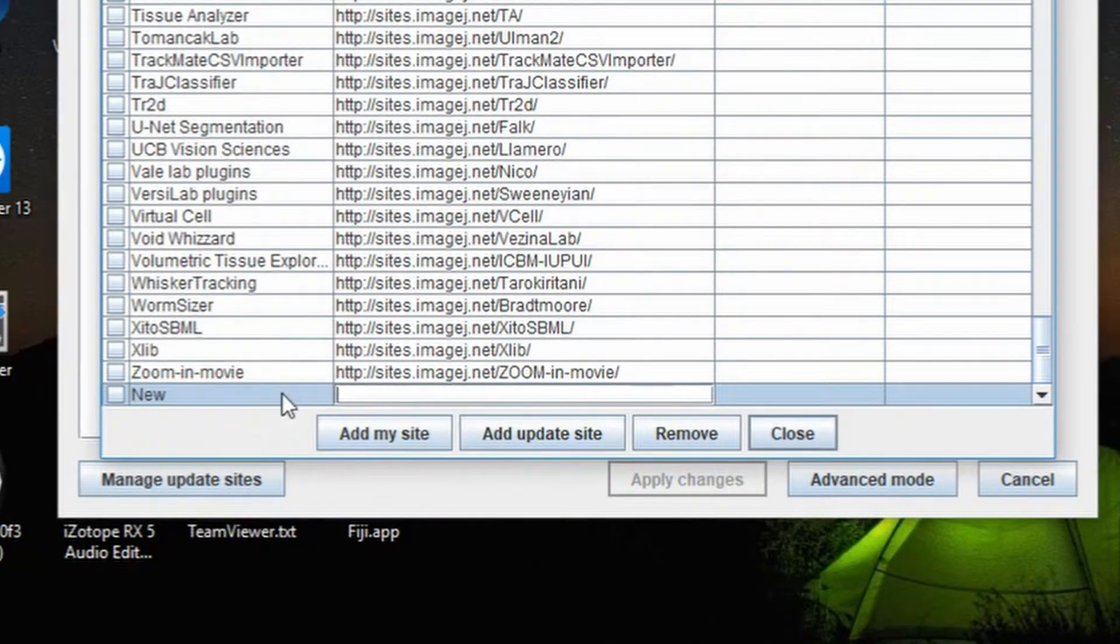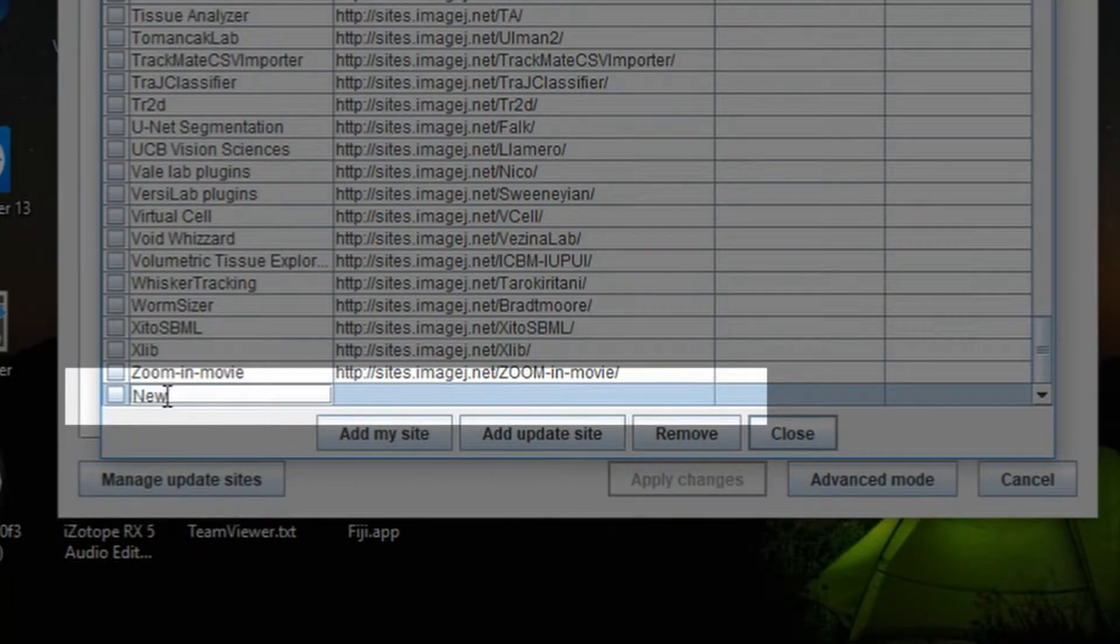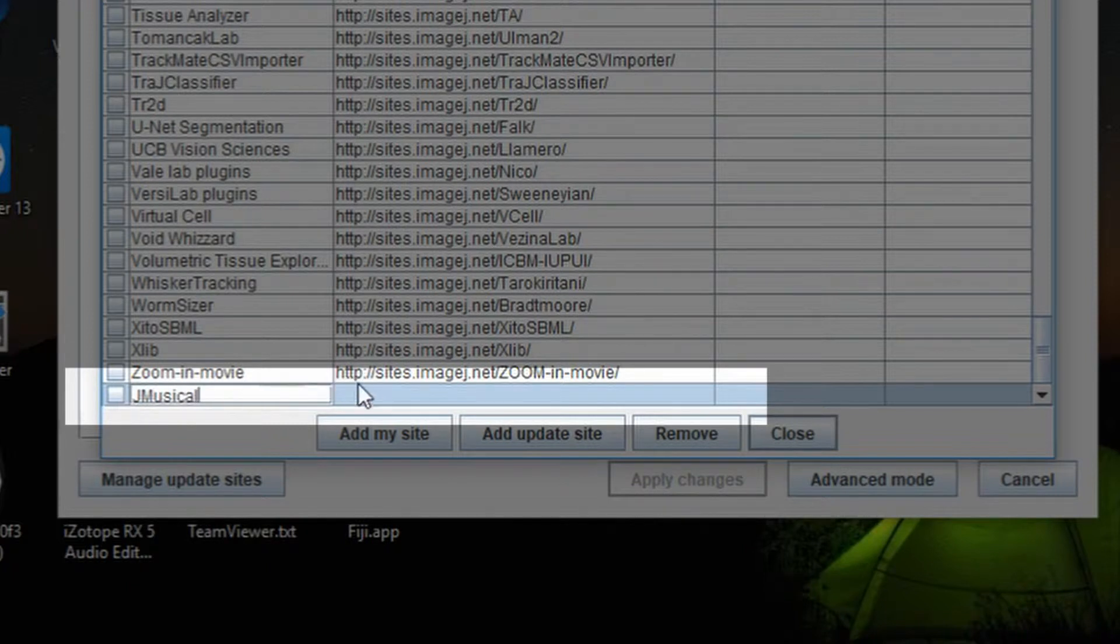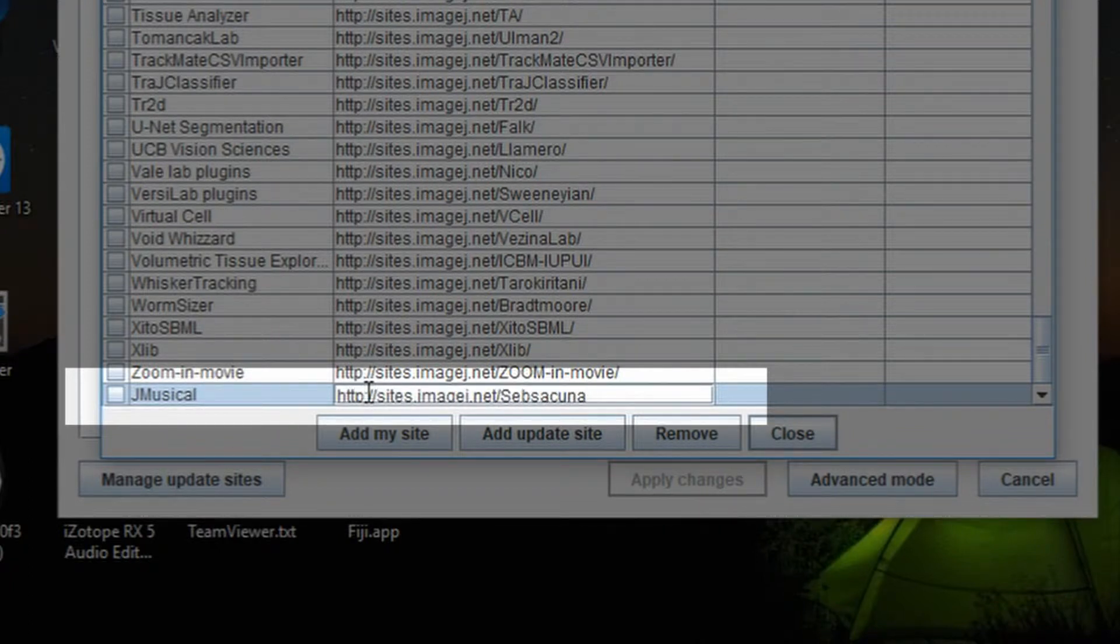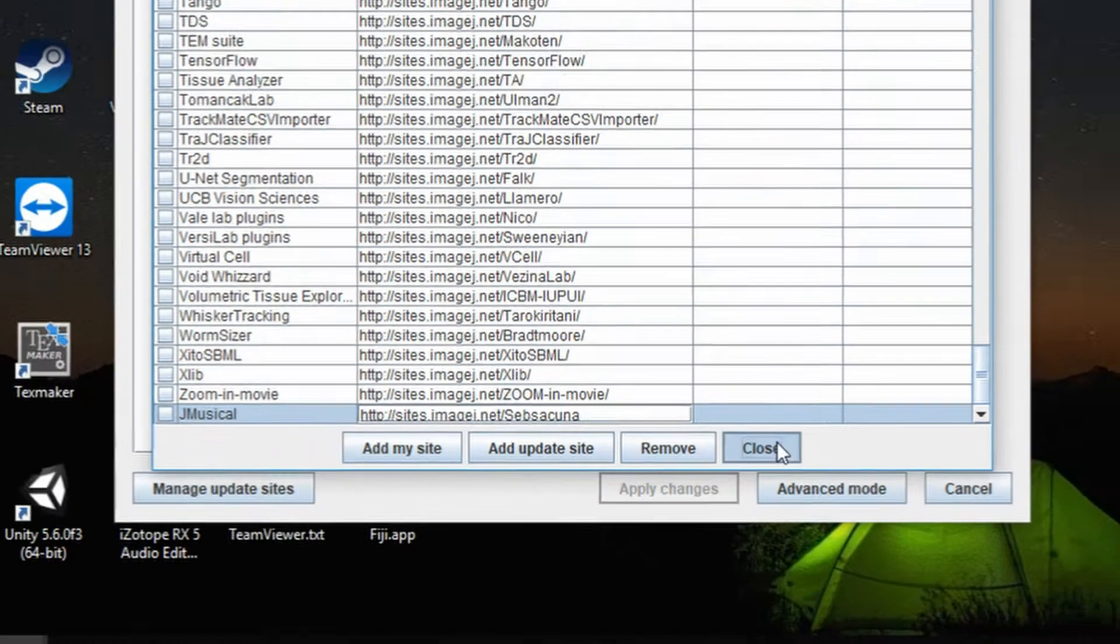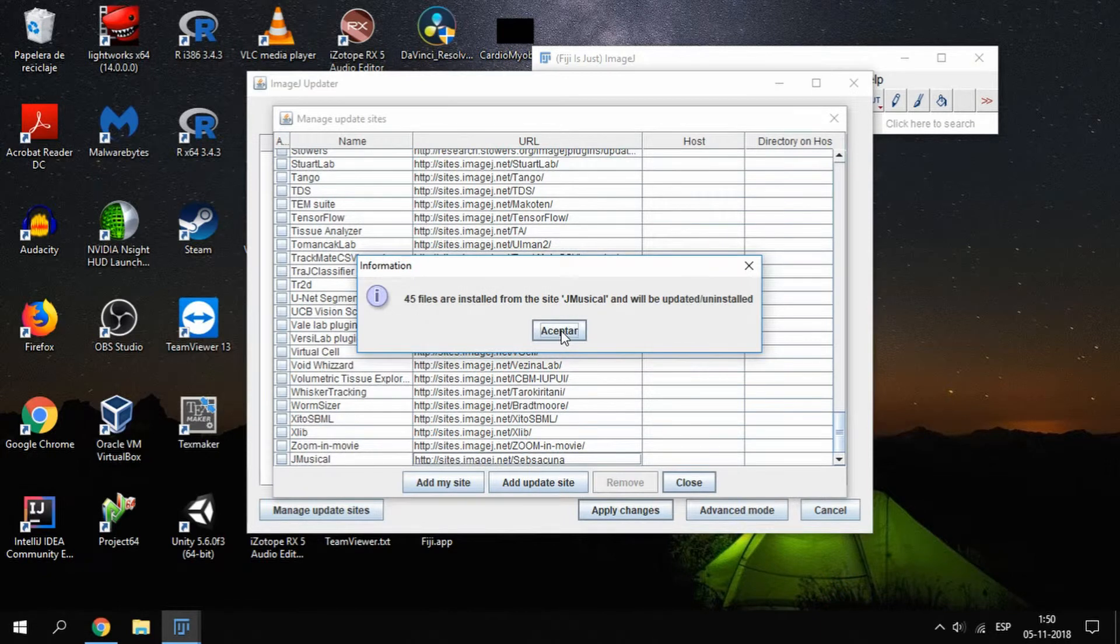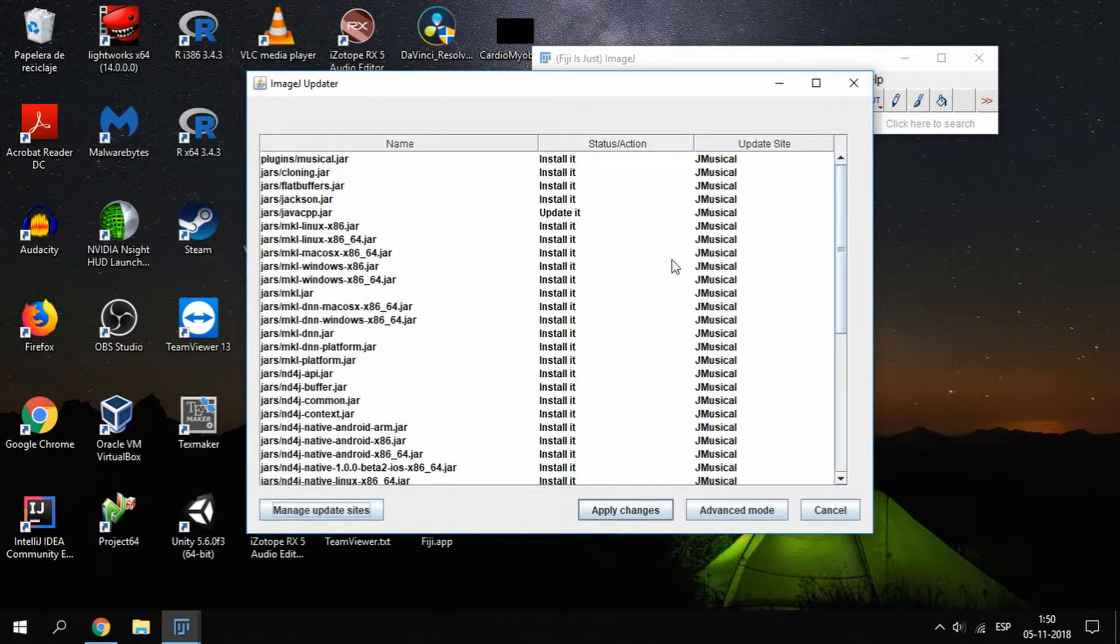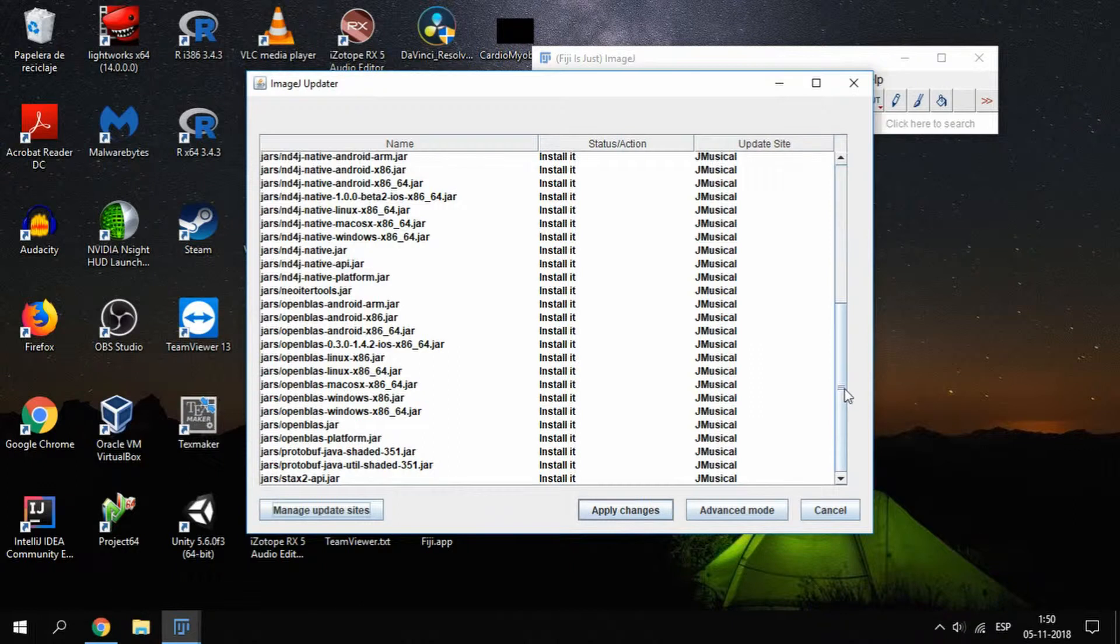You need to set two of the fields. The first one is a name, which is not important, but I will set it as JMusical. And the second one is the link of the repository, where you must use the following link. When clicking on Close, a message should appear indicating the number of new files you need. Just accept it to see the list of all the required files and the action required for each one of them. Now just click on Apply Changes to start downloading.